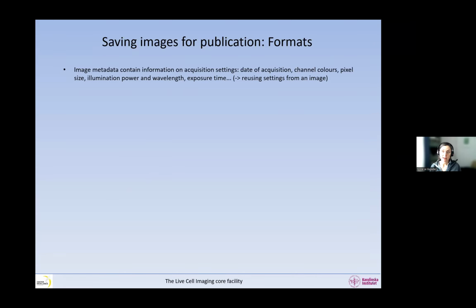And also another thing is that there are different formats that have different levels of compression and quality. If you save in the original format, it is very unlikely that the manufacturer is going to recommend that you compress the image and lose quality, because they want you to gain the best quality out of their images. So save in the format that is recommended, and absolutely not in JPEG and not in TIFF either, except if this is the format that is recommended. And we will see why in a second.